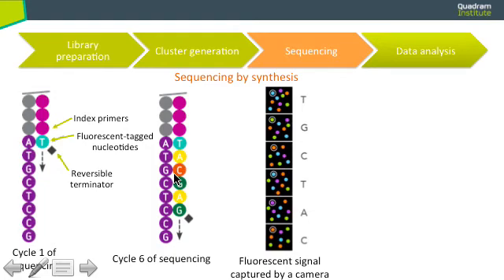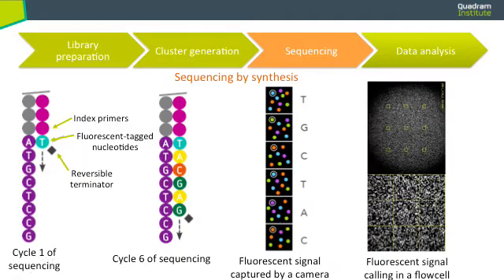And with each nucleotide that is released, the camera will detect the fluorescence from these clusters. So the real version of all of this looks like this. I'm sorry, it seems to be a little bit blurred, but this is the whole clusters, and it detects where the fluorescence comes from, and it captures that as one particular picture. All these pictures are stored and then pre-processed after the sequencing to then detect the nucleotides.